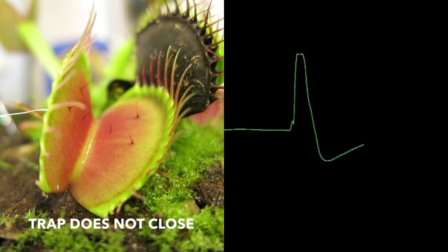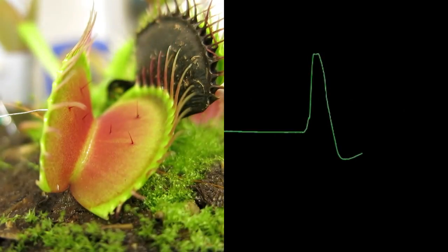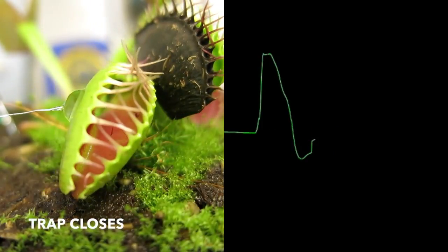You'll notice that when you wait 30 seconds, you get 2 action potentials, but the plant doesn't close. But what if we only wait 10 seconds between the taps? You get 2 action potentials, and the trap closes.